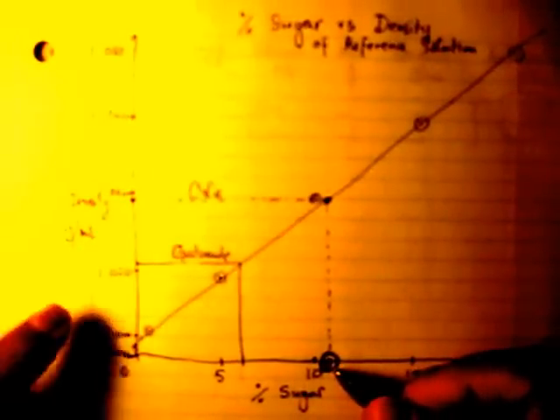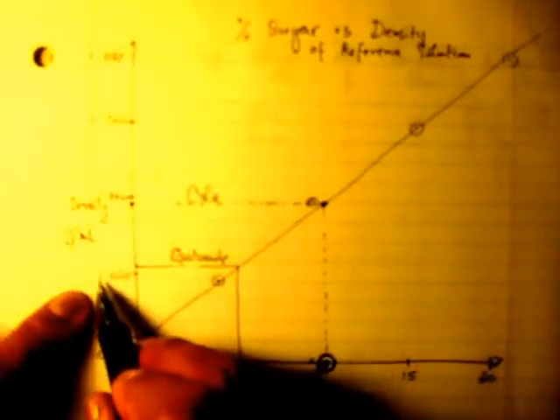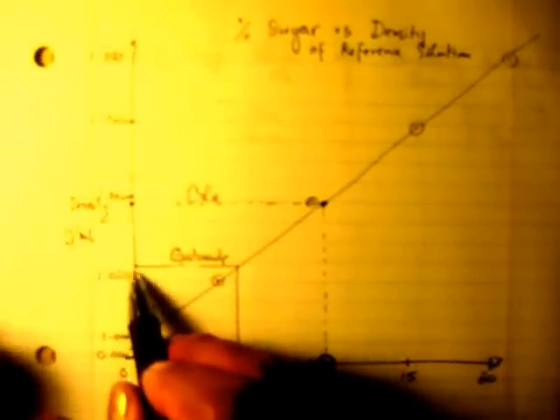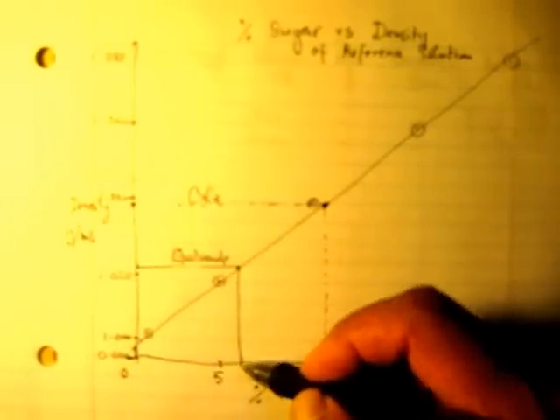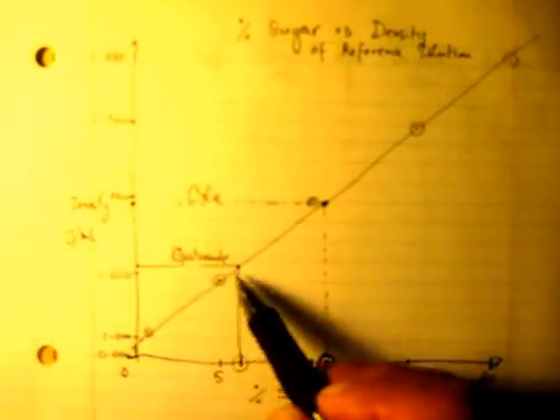So you can go to Gatorade, for example. If the Gatorade average density is 1.021, so let's take this as that point. Now in your graph you can read it better than mine. So you get your point on the graph and then take the percent sugar. So I would like to see 3 lines like this for your 3 beverages, and on top of the line you can write the name of the beverage.